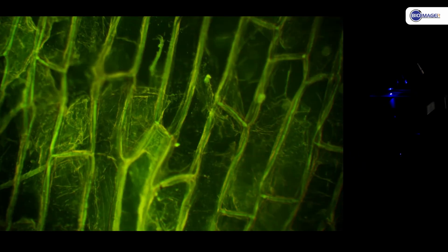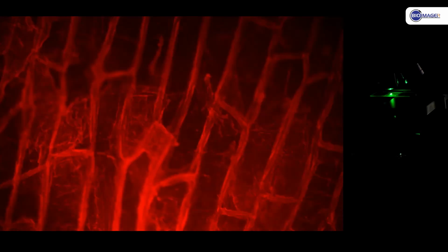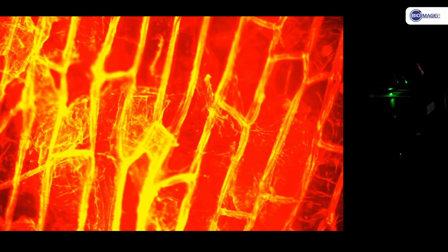emission, and we switch to blue excitation, green emission, and you can see the light in the microscope and also the green image on the screen. And we switch to green excitation and red emission.